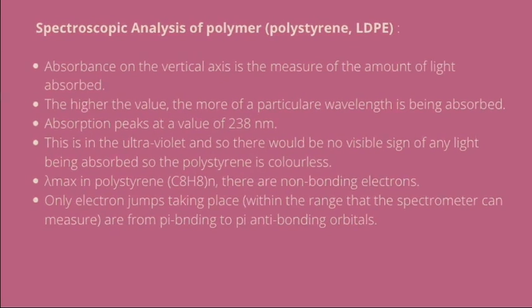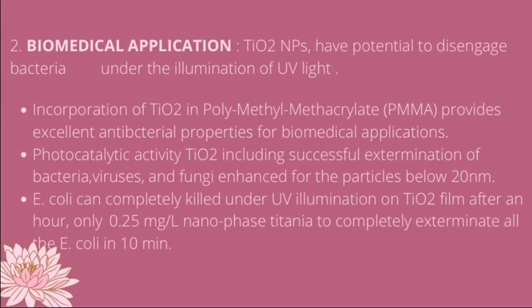Next, an example for UV visible spectroscopy is in biomedical application. Titanium dioxide nanoparticles have the potential to disengage bacteria under the illumination of UV light, as the incorporation of titanium dioxide in polymethyl methacrylate provides excellent antibacterial properties.